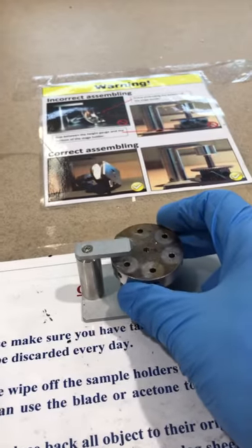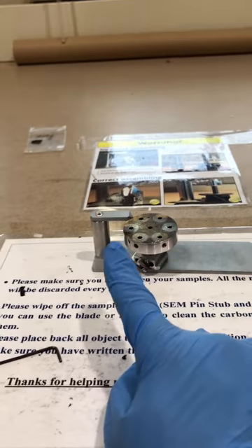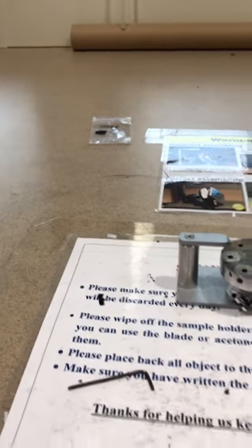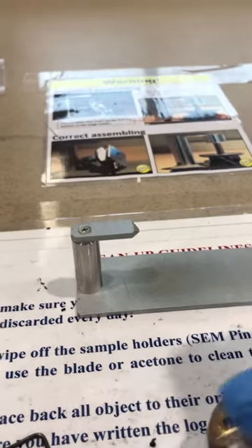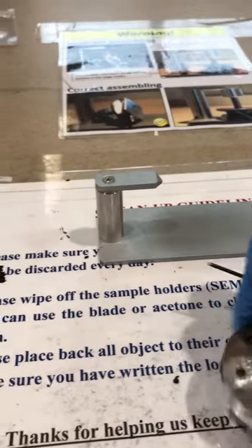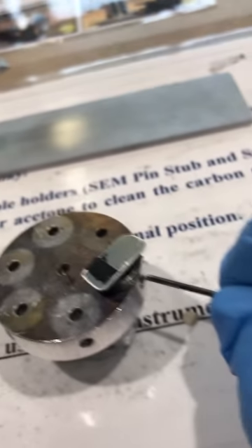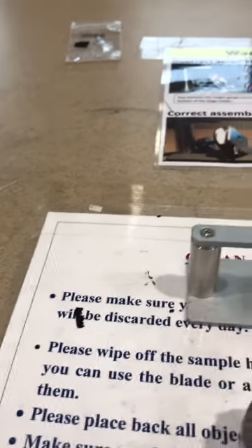Next, I need to make sure the height is not above the desired height. Prepare your sample, put it on the stage, then you can use a screwdriver or a key to screw the screw next to each sample to fix that sample to the stub.